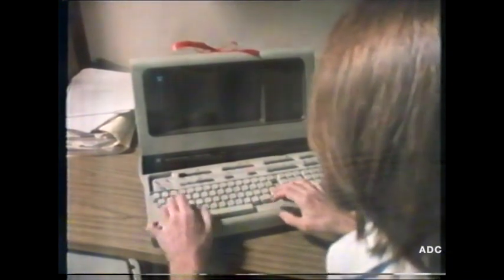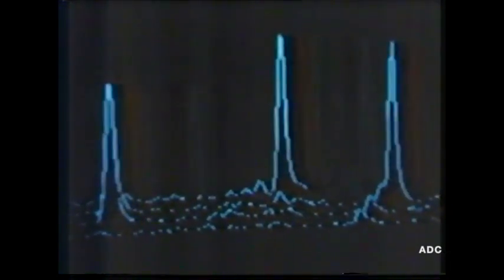A computer can be used to display the actual amino acid sequence for the protein being investigated. The position of the peaks shows exactly what amino acid has just been determined. The process continues. Another amino acid is broken off and identified. That second trace, just behind the first one, has peaks corresponding to a second different amino acid. The sequencer carries out in hours what would otherwise have taken years of work. As the amino acids are split off and identified, the picture of the protein is built up. This gives us the whole protein chain, which amino acids and in what order.